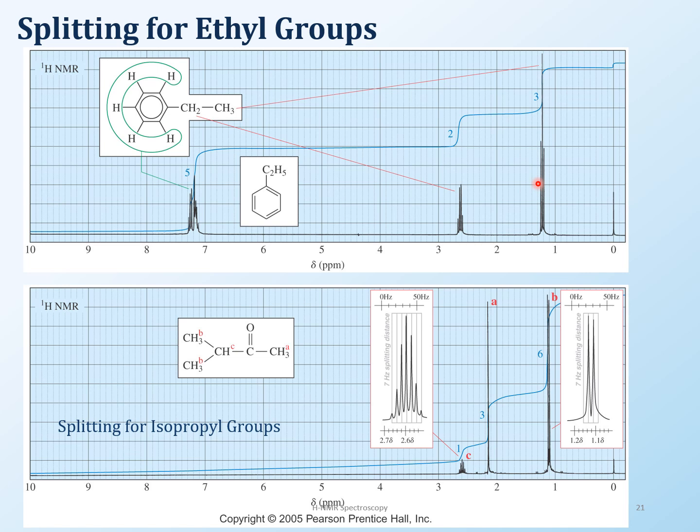Now, when I talk about NMRs, I give you clues about what you should be looking at. In the chemical shift, I gave you clues: look for aromatic protons at 7, look for aldehyde protons. In the splitting, my clue for you is if you see a triplet and a quartet, then most likely you have an ethyl group somewhere. And see, the benzene protons are coming at 7.